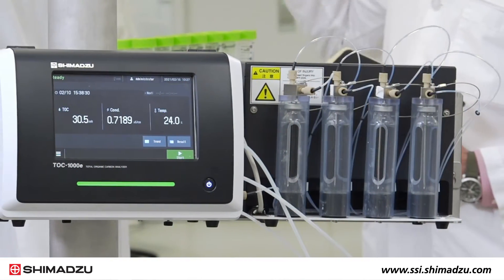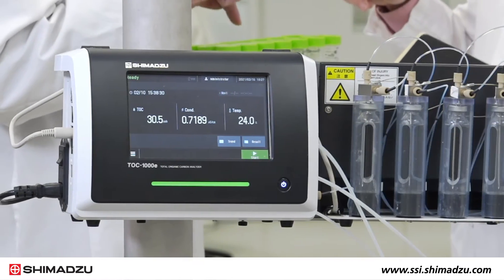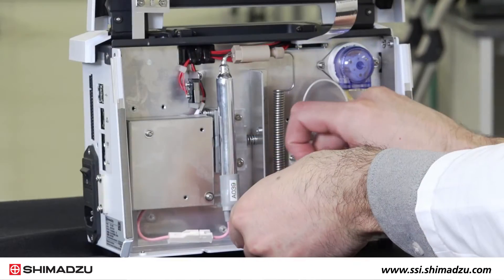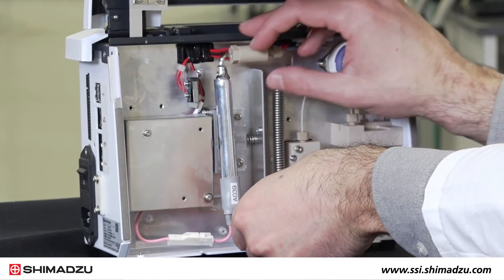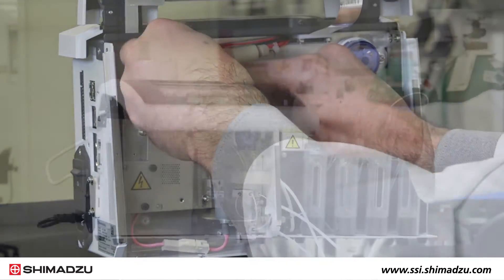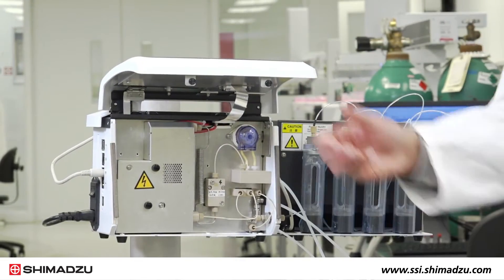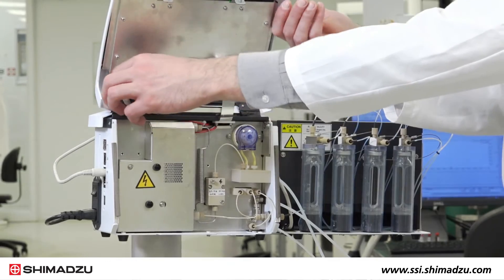The TOC1000E is designed to be easy to use and maintenance-free under standard use for a year. When regular maintenance is required, the only parts that need to be replaced are the excimer lamp, pump head, and filters. All parts can be accessed via the front door of the analyzer and easily removed or installed without any tools.